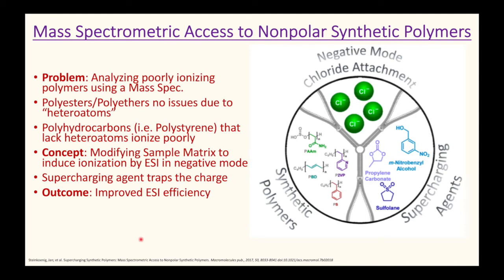is that they make a very interesting point, indirectly at least, that ESI should be the more commonly used source to ionize polymers. Now, if you think about it, ESI enables a broad assessment of polar polymers, proteins, and other materials that solubilize in solvents that are most compatible with ESI.